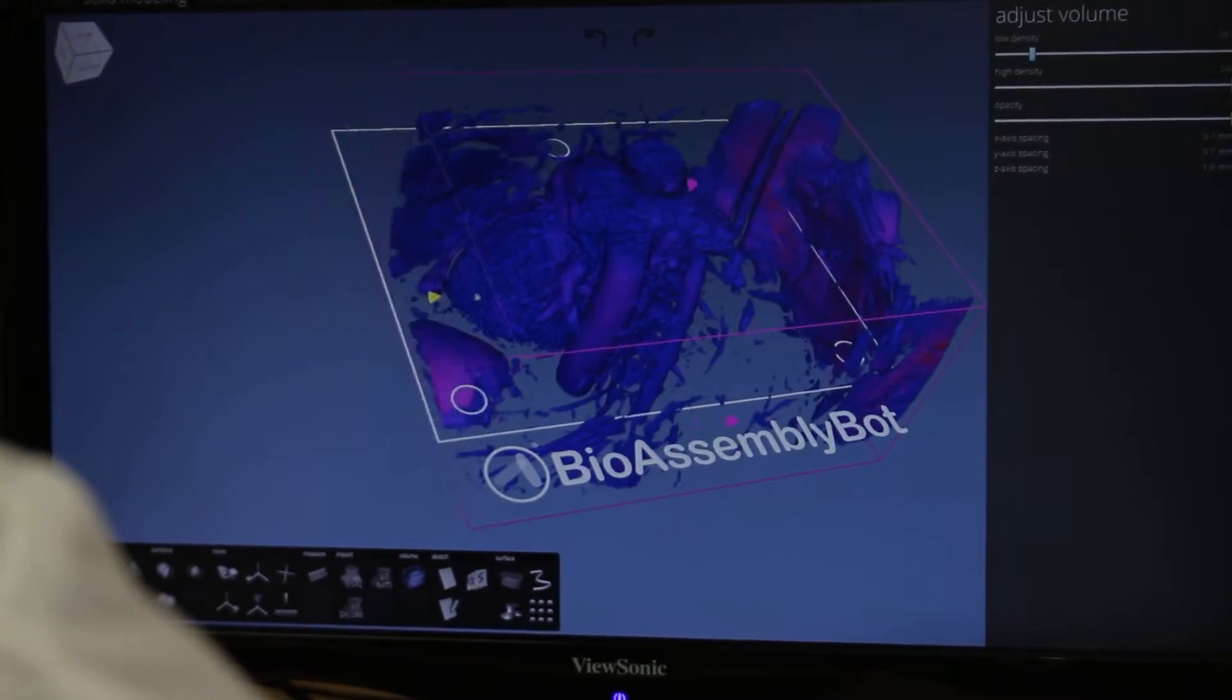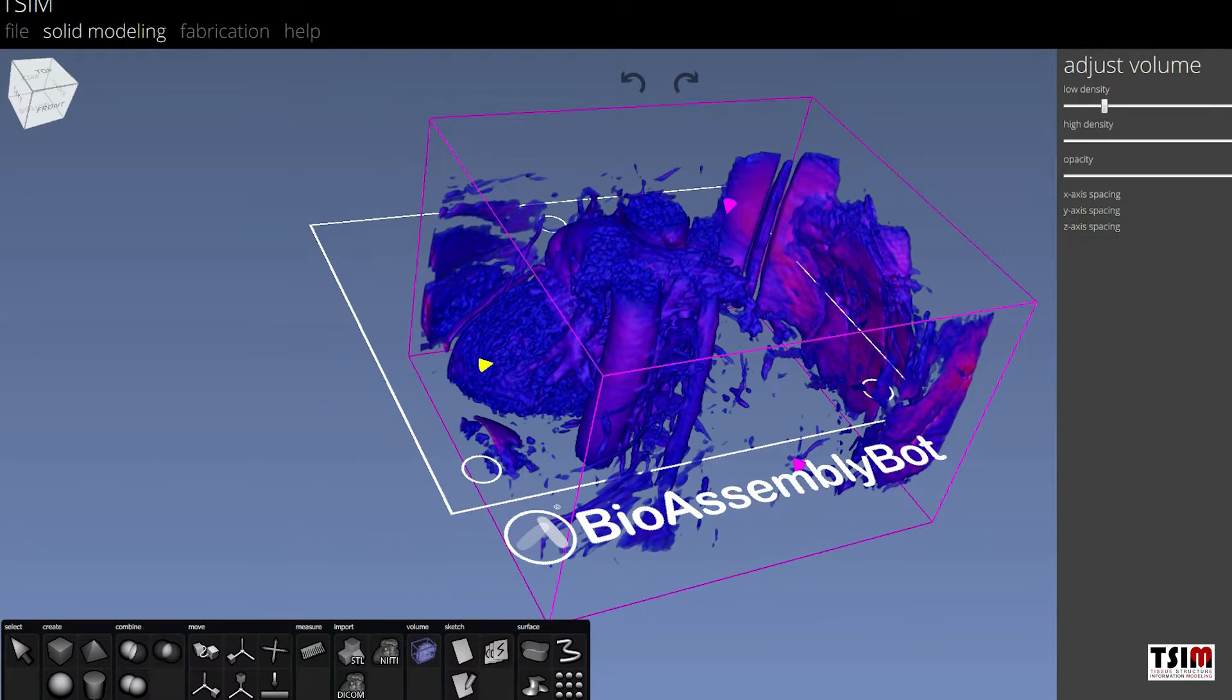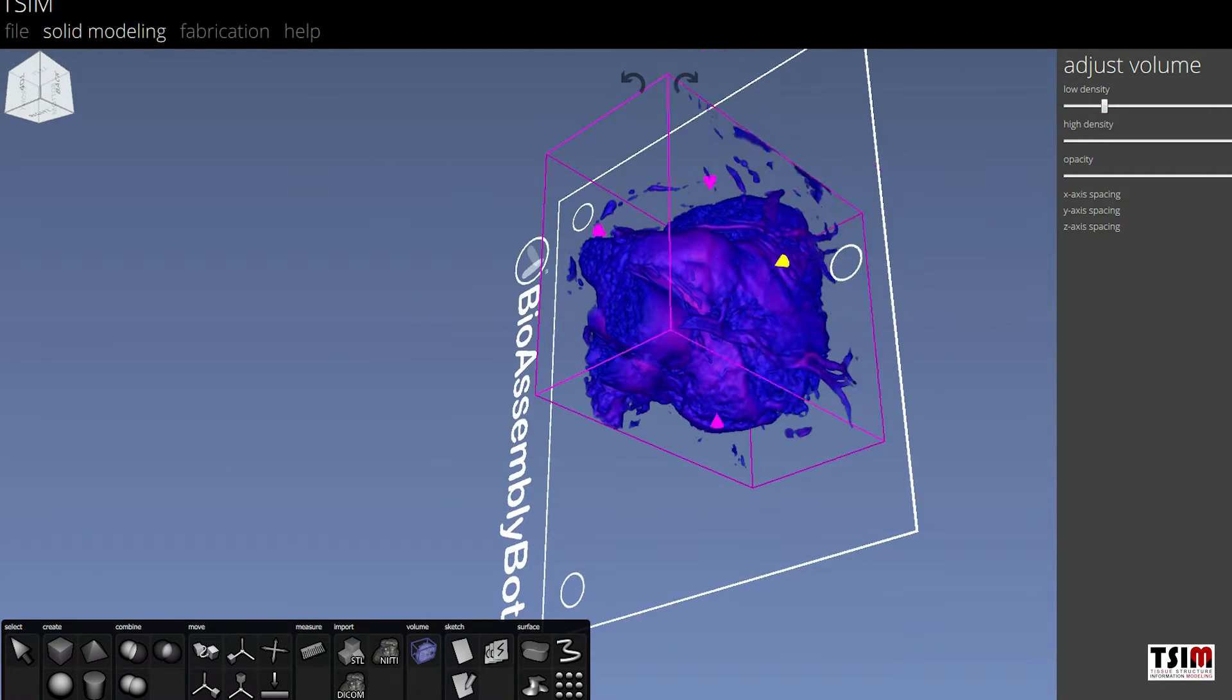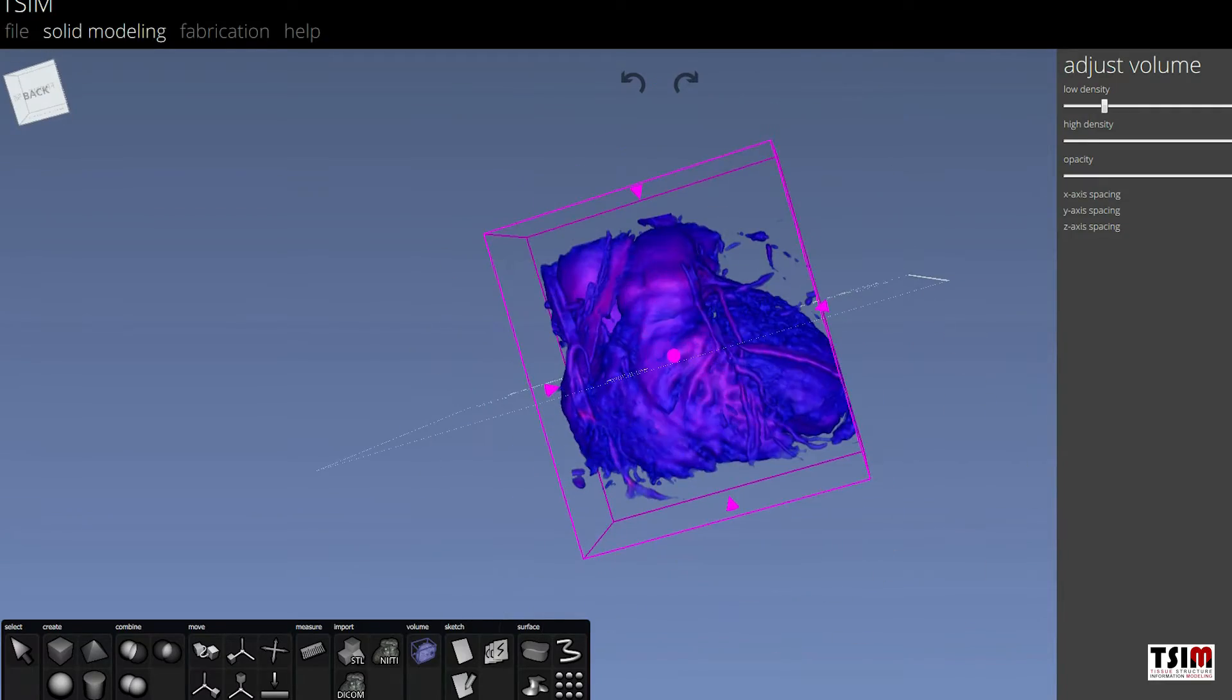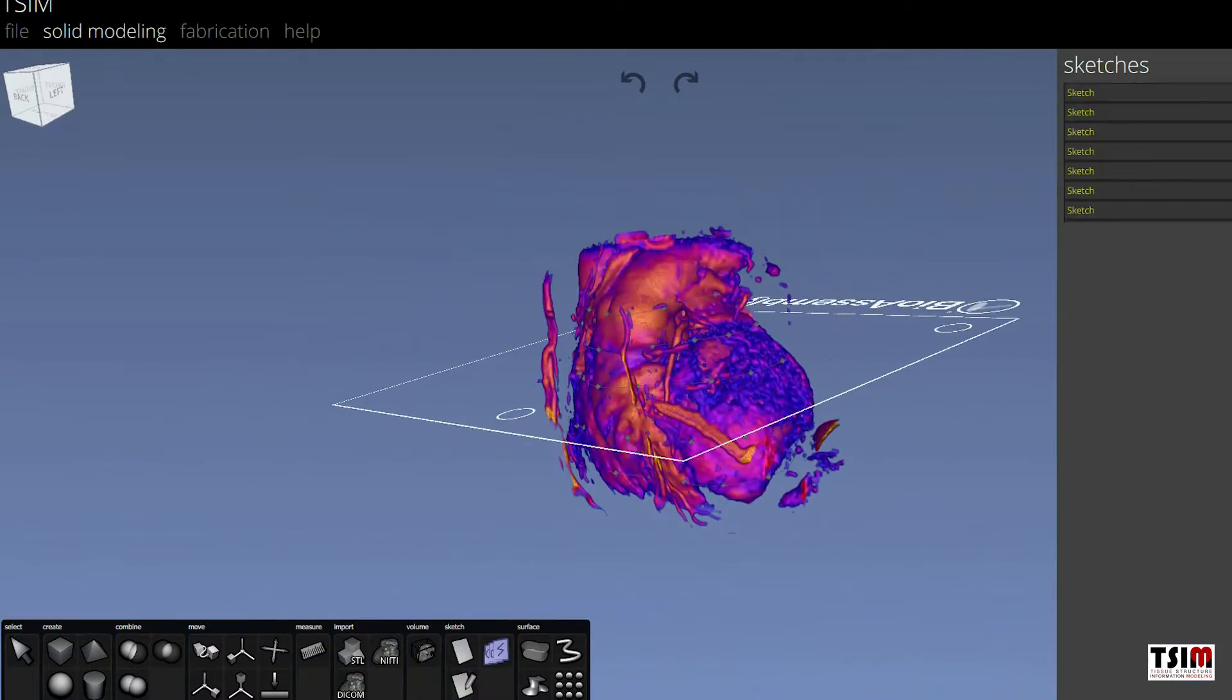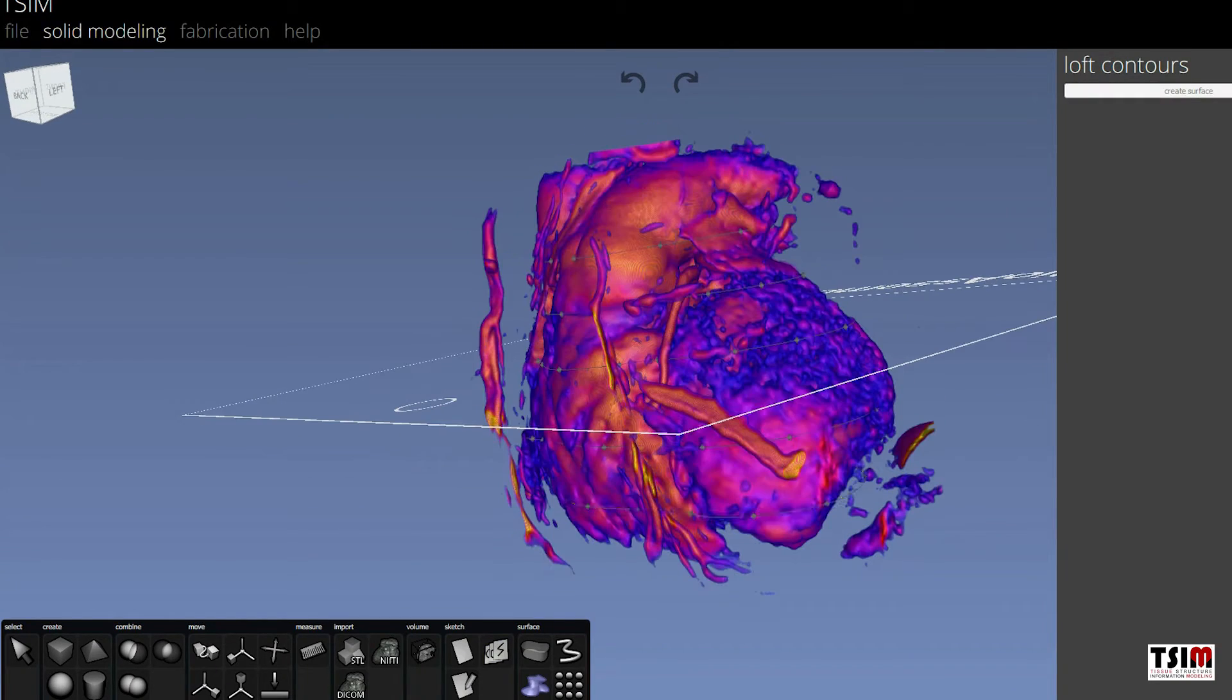The whole process begins with importing image data from a patient. In this case, the technician is working up a MRI data set showing a patient's heart and creating a 3D computer model of the heart within the TSIM software.